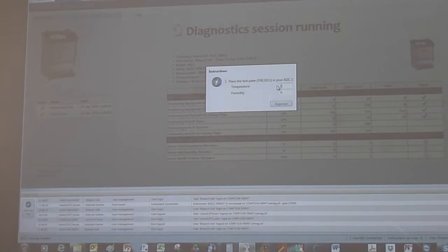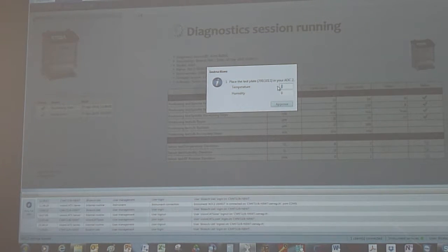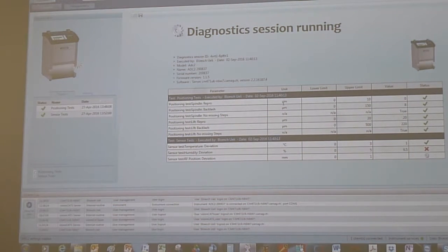So now, temperature. What would you think? Not now, because it's already in the motors. Temperature? 20? No, 20 is too low. 30? No. 24, 24 is also good. Humidity? That's difficult. 54, I would say. 6.5. But I don't know in which direction. Anyway, it's not important.